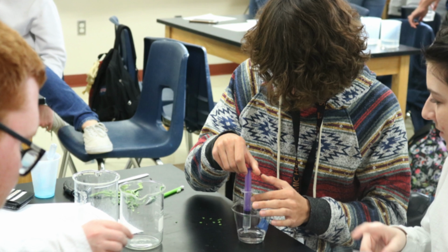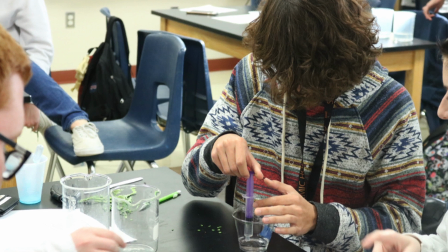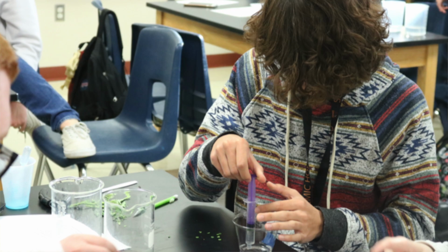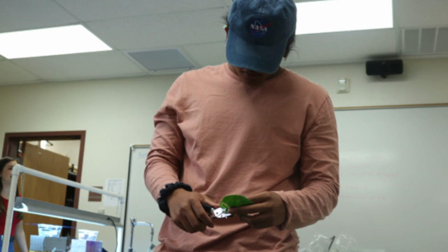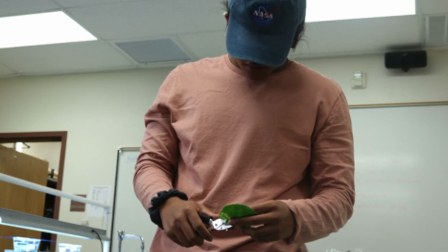Students will take syringes with plungers. They'll take the plungers out and they'll put into the syringes some of the bicarbonate solution that they would have prepared earlier, and they'll also take the leaf discs that they would have punched out using hole punchers and place them into the syringe as well. And then they put the plunger back in, and then they basically create a vacuum. And the purpose of this is to take the oxygen that's inside the spinach leaves and remove that, basically squeeze or push that out.